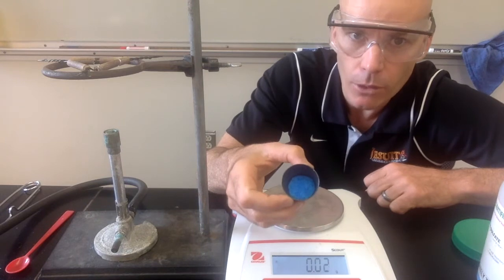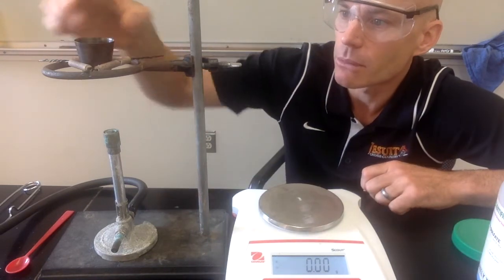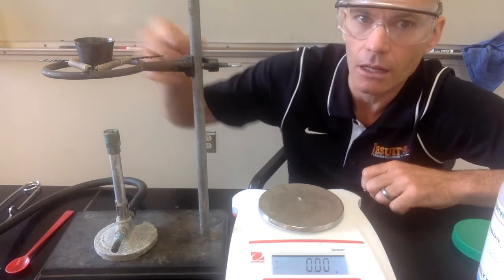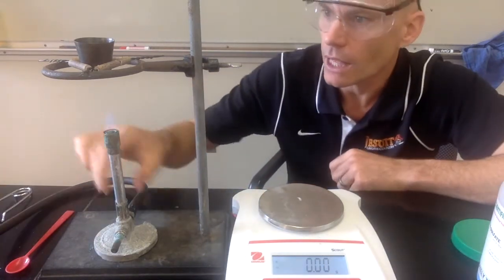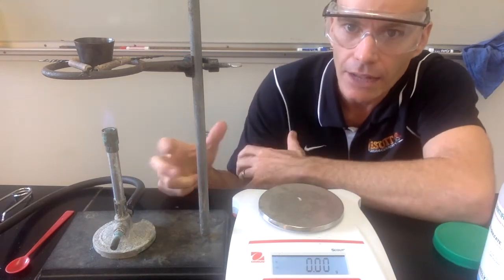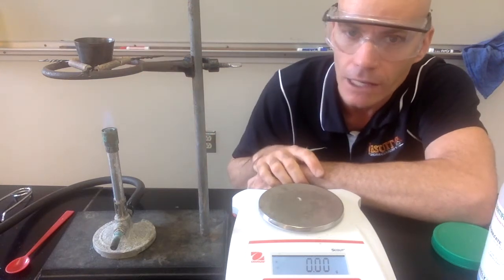The way we're going to remove the water from this hydrate is by heating it on a Bunsen burner. I've got a Bunsen burner set up with a ring stand and a clay triangle. We'll light our Bunsen burner and heat our crucible with the hydrate in it. As it's heated, the water will evaporate out and we'll be left with just the copper sulfate.